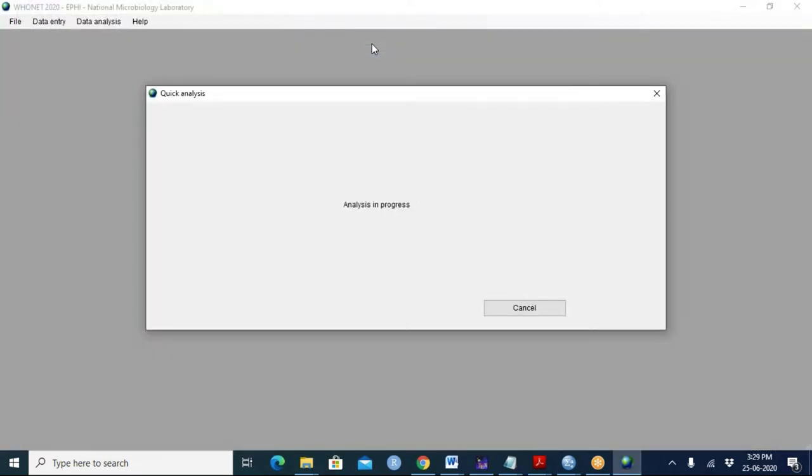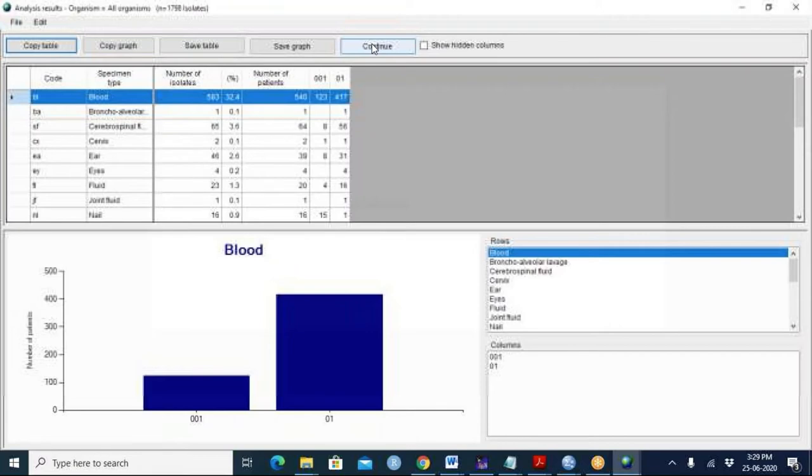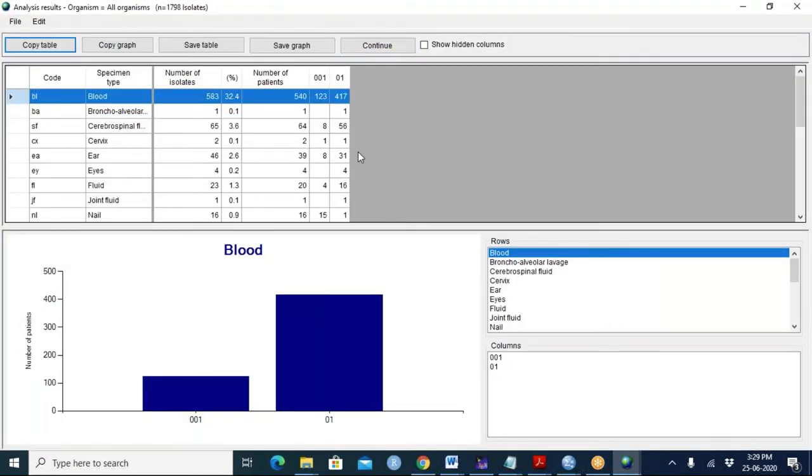So this is a comment. This is not about data cleaning, this is about going back to the laboratory and saying, thank you. In January, you were 70% complete. Let's try to do a better job in February. Let's try to do a better job in March so that we can look at the completeness improvement over time.